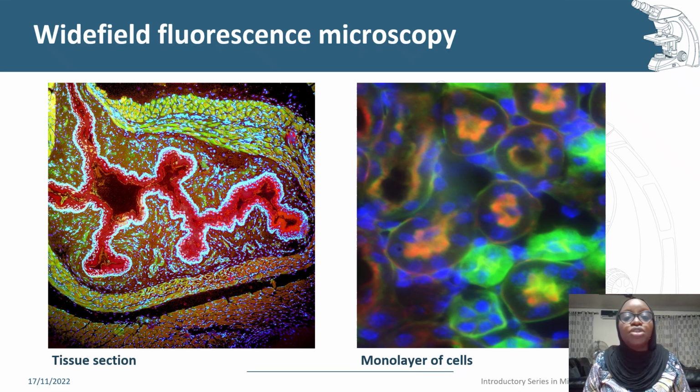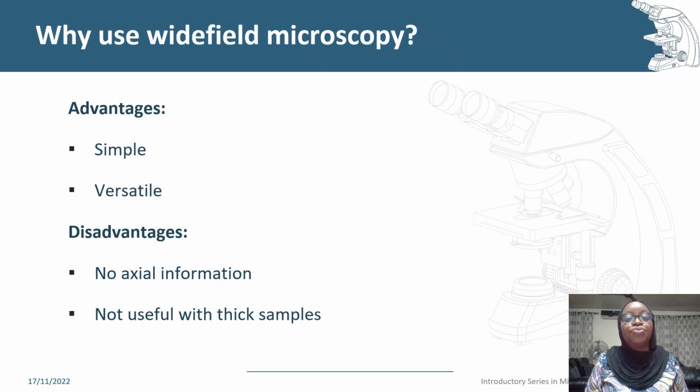This is most notable with high numerical aperture objectives, precisely when you want the best clarity. In many cases, it is not ideal to observe the extra information from other focal planes, as it will skew our interpretation of an image.